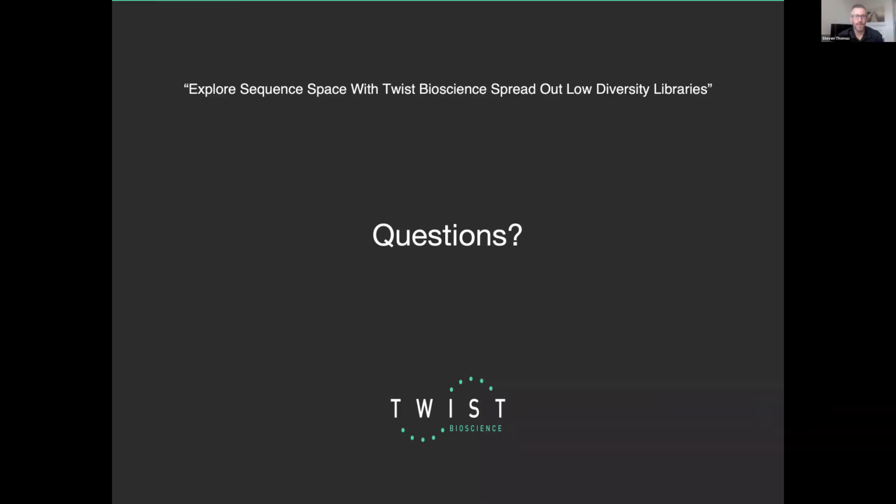You kind of answered this, but what would be the limit of the number of positions that can be mutated in a sold library? I would like to say it's limitless, but as you can see, I don't know if you remember from the last slide, the diversity can be up to 10 to the 8. I know that there are some people who want a library that captures 10 to the 81 in diversity. Well, that's not possible.